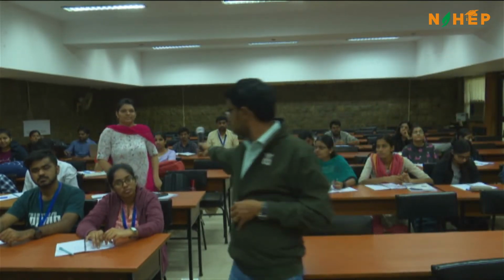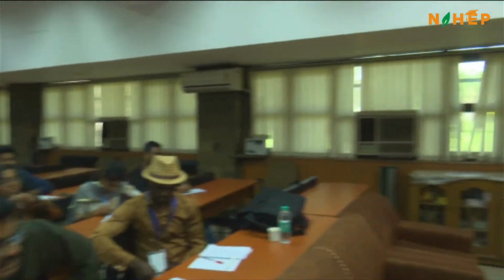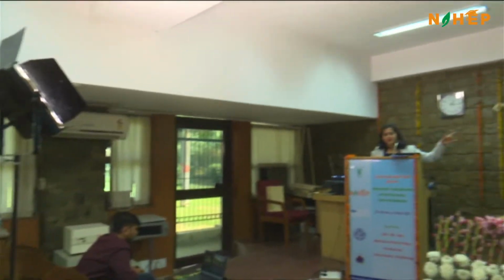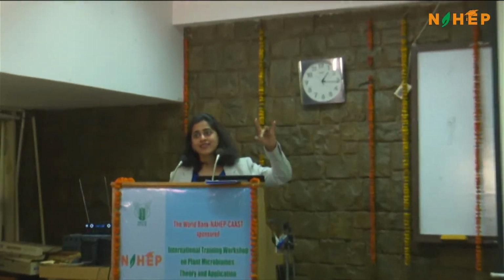Just adding on to his point: when you're doing an amplicon analysis and you have mitochondrial or chloroplast contamination, there is a step in QIIME. In this case, we don't have to do it on the reads because we are stitching the reads in the beginning, right? There is a step in QIIME itself to filter out these mitochondrial or chloroplast sequences.